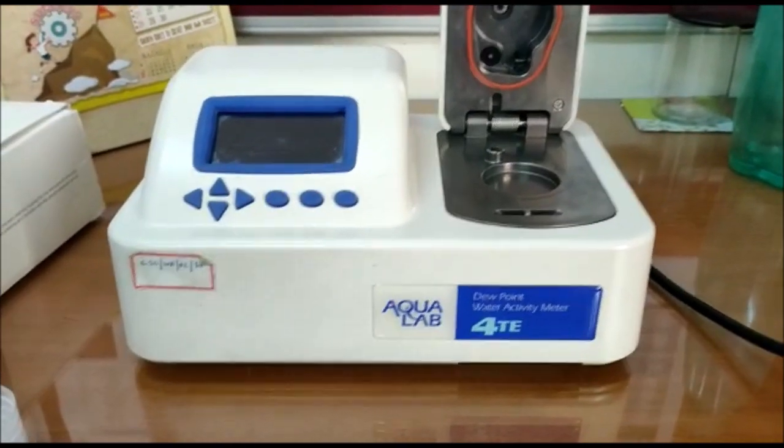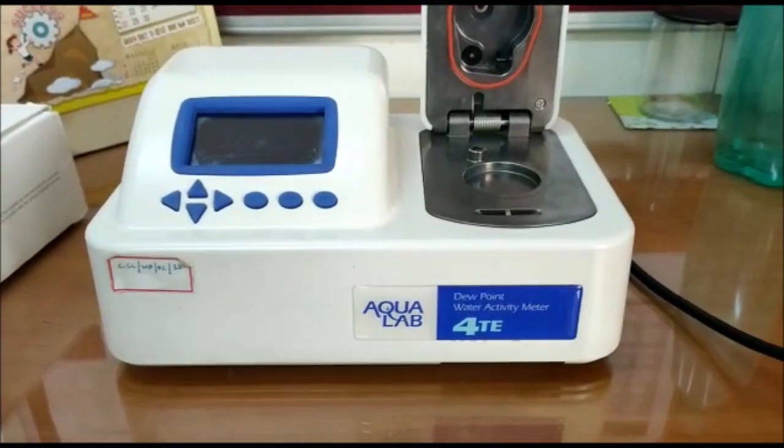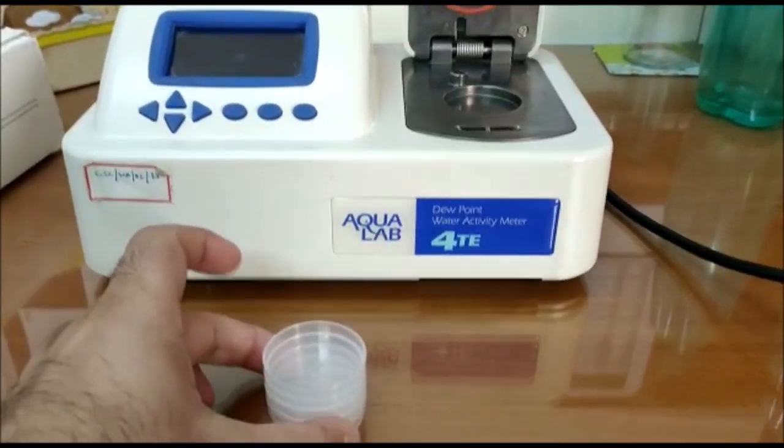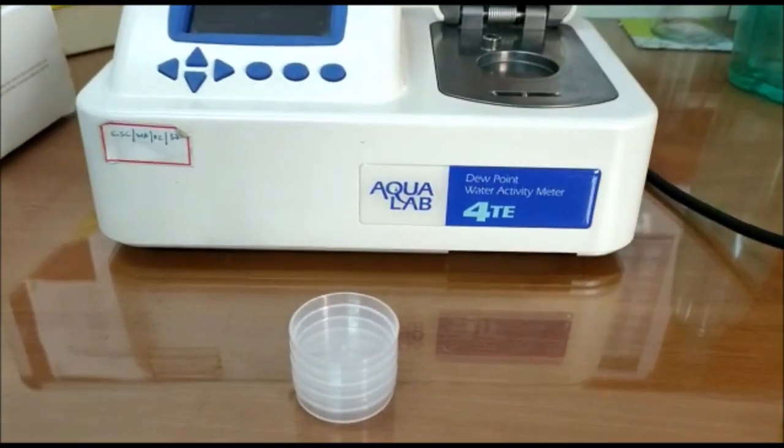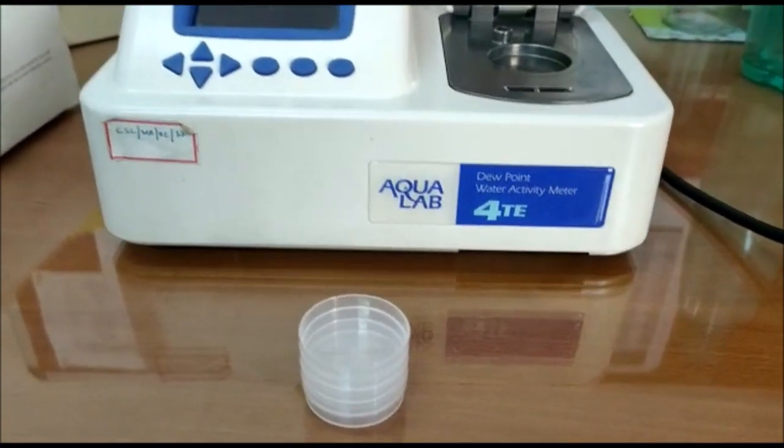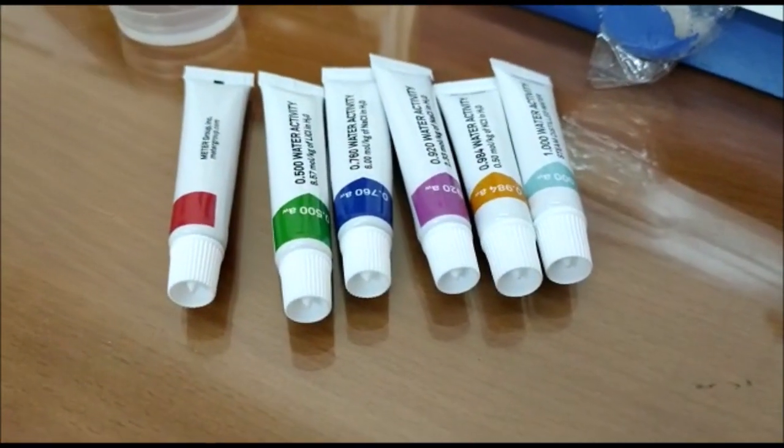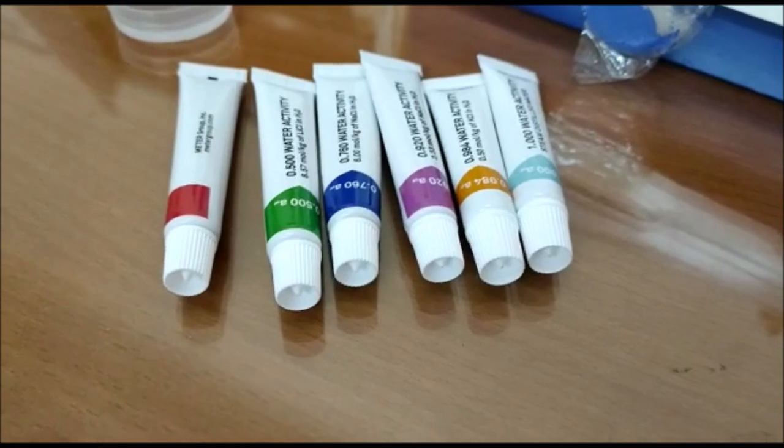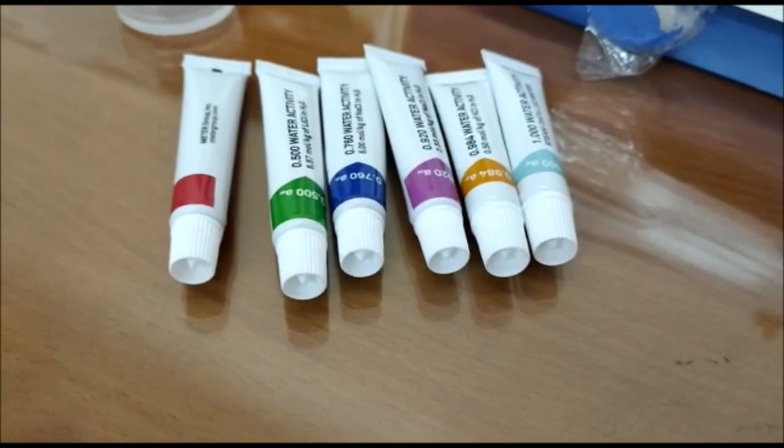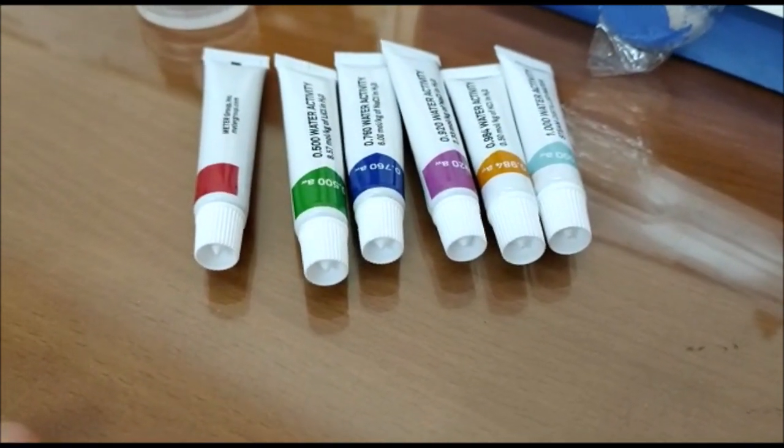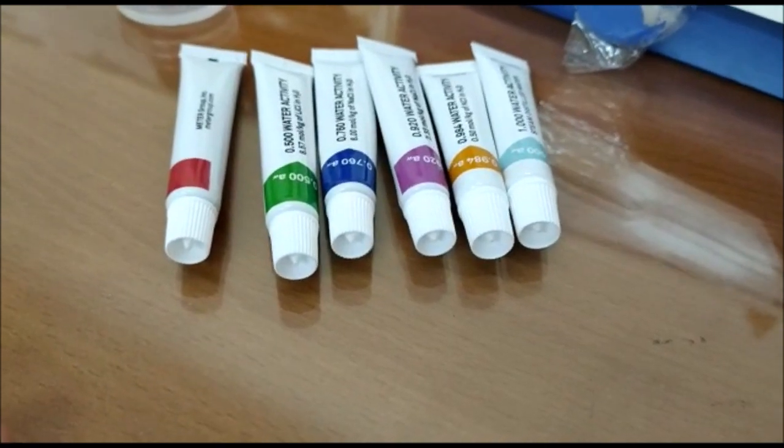In the package you will get the main instrument, stackable cups with lids. You get 50 cups in the package and you will get standards for verification and calibration of instrument. We have the entire range of calibration vials starting from 0.15 water activity up to 1 water activity.